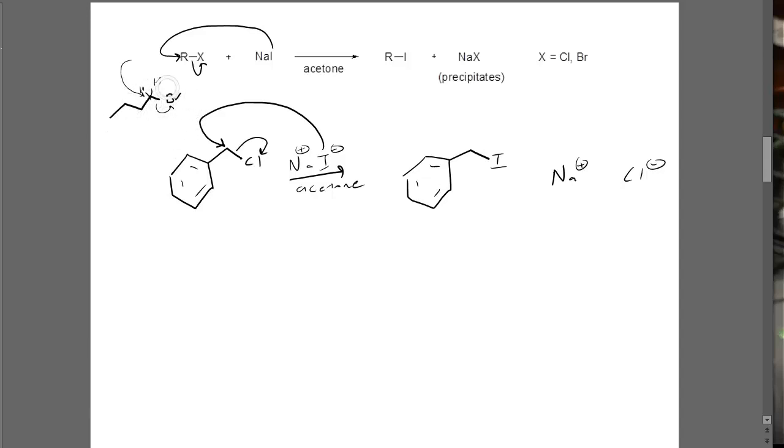But our leaving group, our bromine, is actually a better leaving group. So that's going to drop the energy level of the transition state a little bit more than even having the less bulky backbone here. So this reagent is faster. We've got a primary substrate, but it's got a better leaving group, which you can use to then justify why this reaction was faster than this one. But then the question is, why wasn't this one a little bit faster? So that was actually 4th place from our ranking.